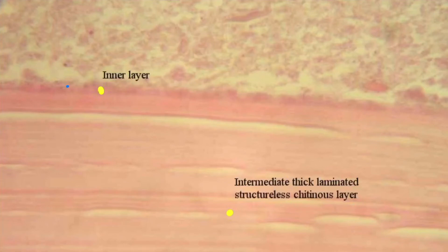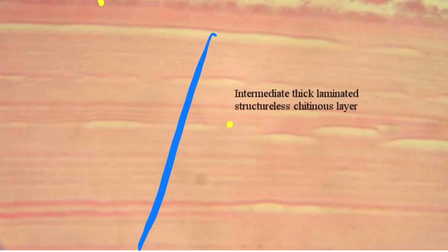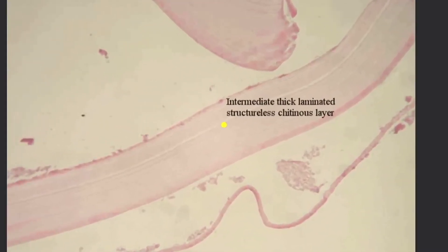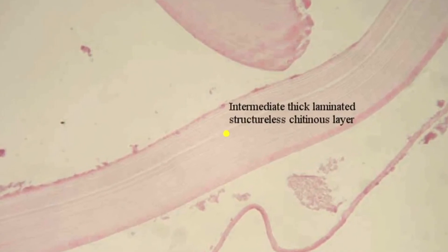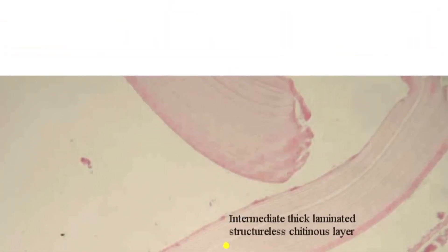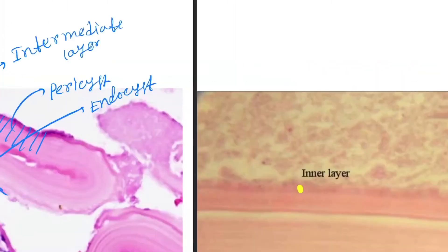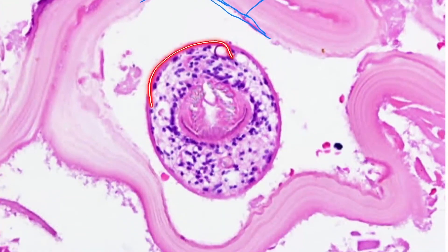In another picture, the inner layer is very thin — here it is the inner layer. And these are the intermediate layers, you can see the intermediate layer. Here is the inner layer, and here is a daughter cyst. You can also see the daughter cyst here. So this was the hydatid cyst.